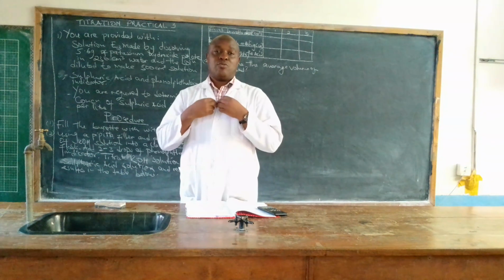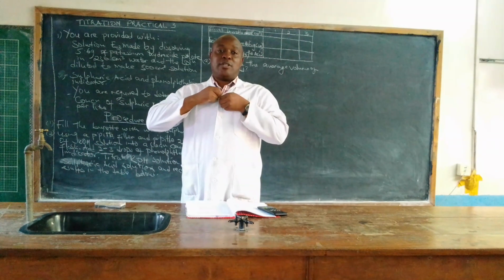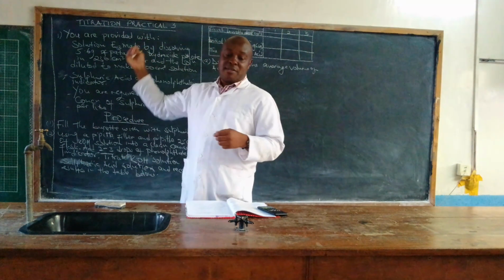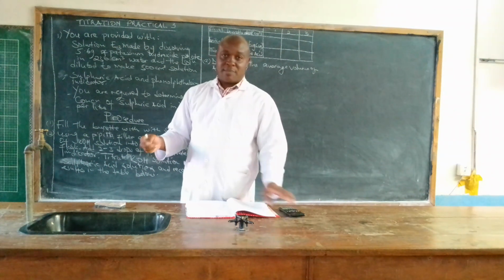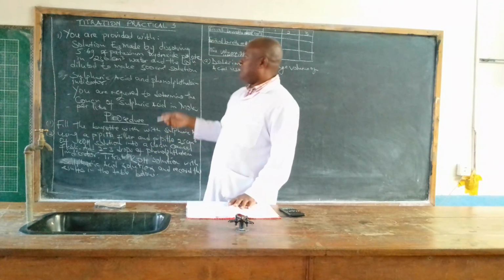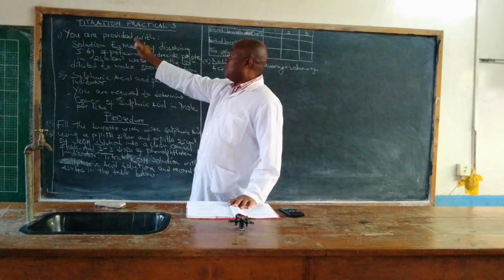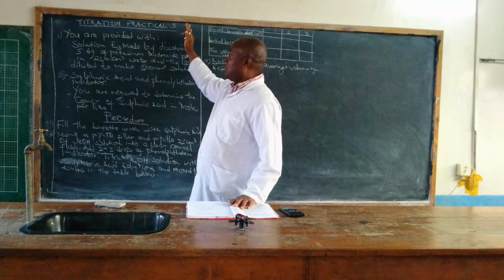Today we are just going to do our practical 3, titration practical 3, and we are proceeding with our series. So today, the procedure is clearly on the board. By the way, I'm Charles Alena. I'm just trying to introduce to you practical 3, titration practical 3.